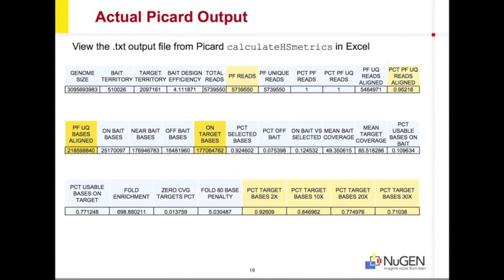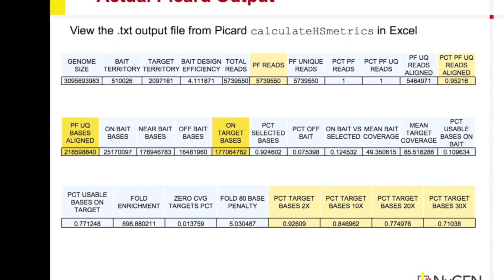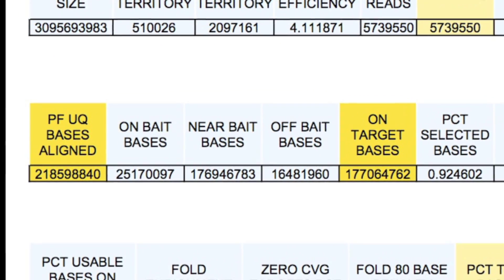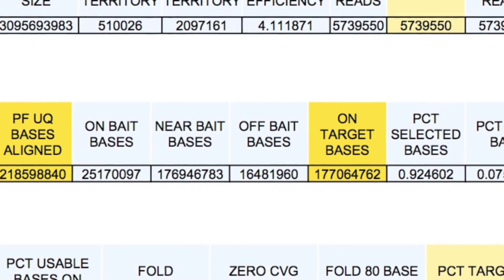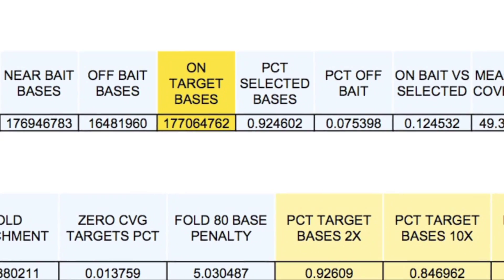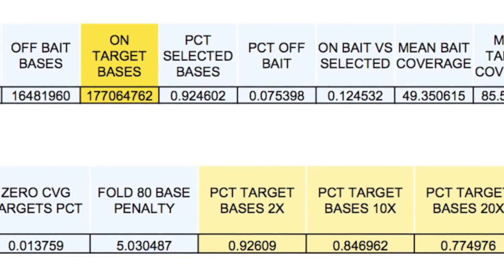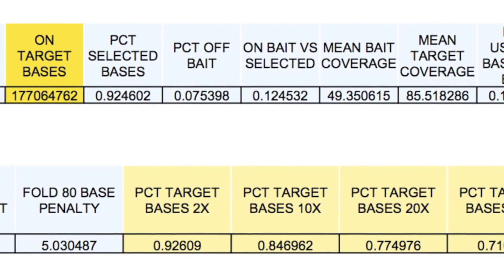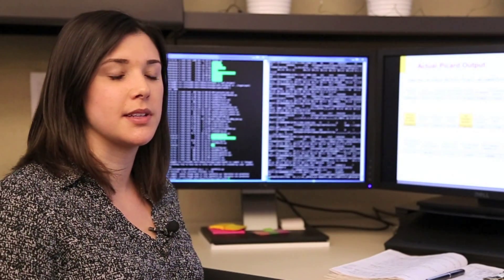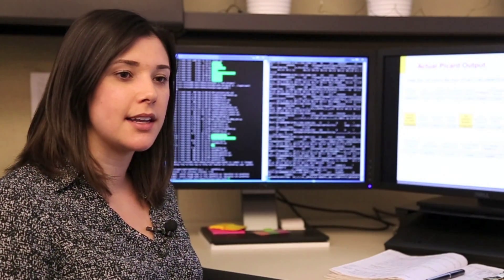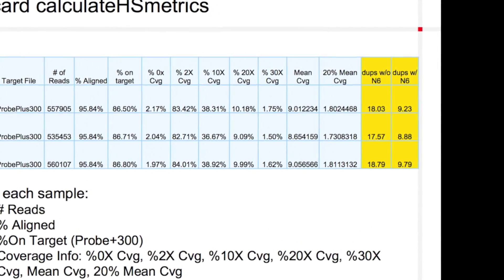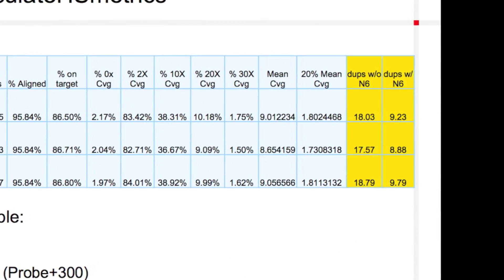Picard Calculate HS metrics generates a table containing the number of bases aligned and the on-target bases that can be used to calculate an on-target percentage. Also within this table are metrics on the percent of target bases covered at various coverage levels. Information from this table can be compiled and simplified into a summary table including alignment and N6 duplication metrics.